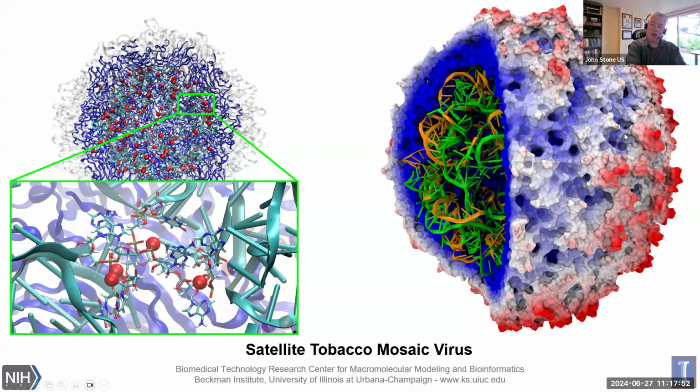When we combine the color with the shading, in the shadows, then we can see this 3D structure that much more clearly. Another thing I would point out, if you look on the left, when you have a more sparse structure, something that is very stringy, as proteins are, when they're spread out front to back in space, or you're zoomed in significantly, like in this case, you can use depth cueing to accentuate that 3D perception.